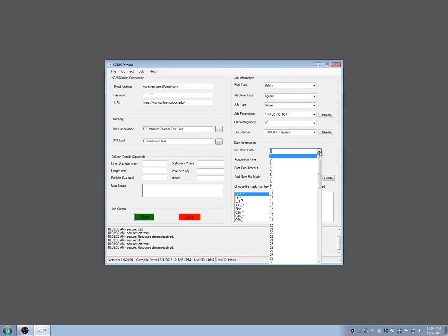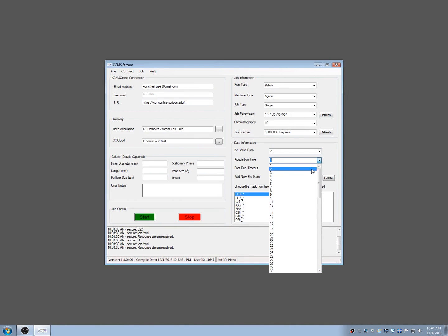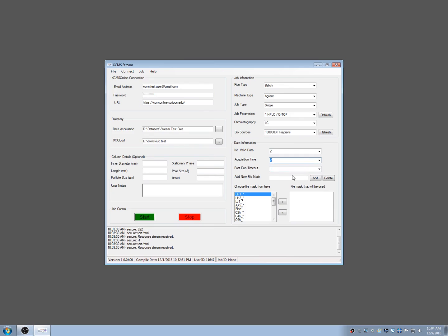Last, you need to enter the number of data files, analysis times, and respective masks. XCMS Stream uses masks to recognize files belonging to each particular dataset. These values are important to the synchronization process. It is important to note that file masks must be unique for different groups and previous masks cannot be reused.